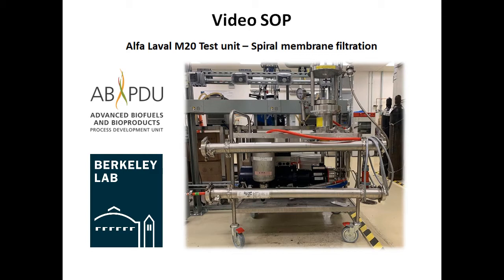In this video SOP, we'll take a look at the Alpha Laval M20 Crossflow Filtration System and learn how to set up and operate the equipment for use in processing material generated from microbial fermentations.